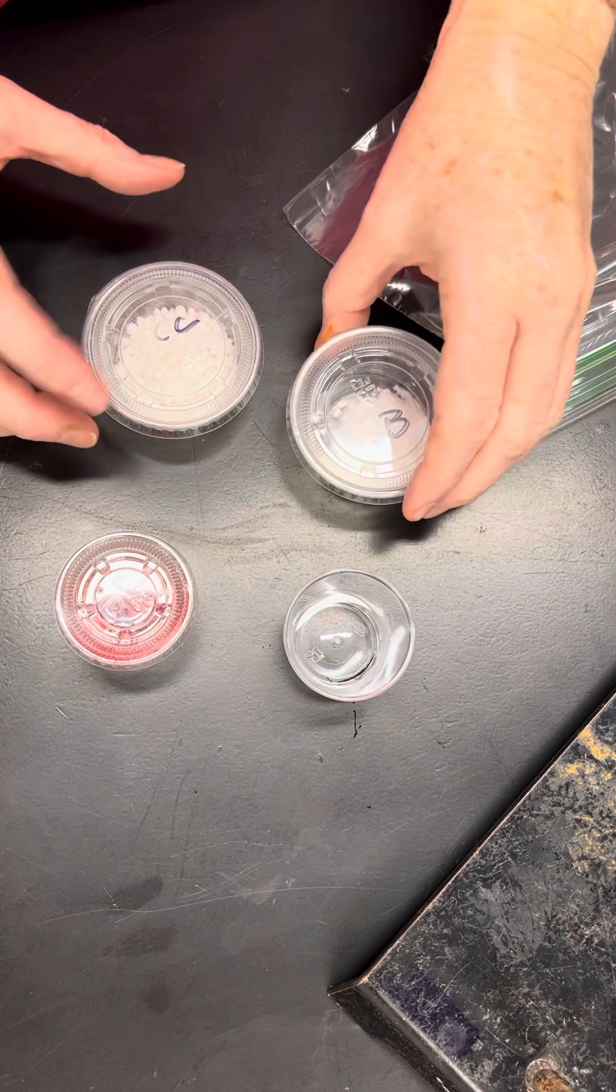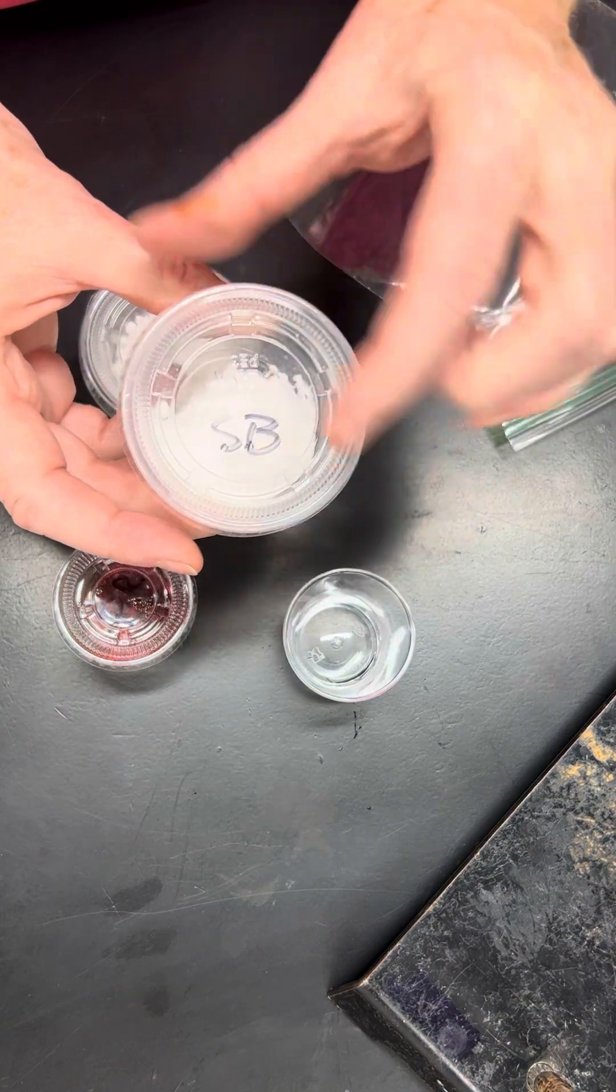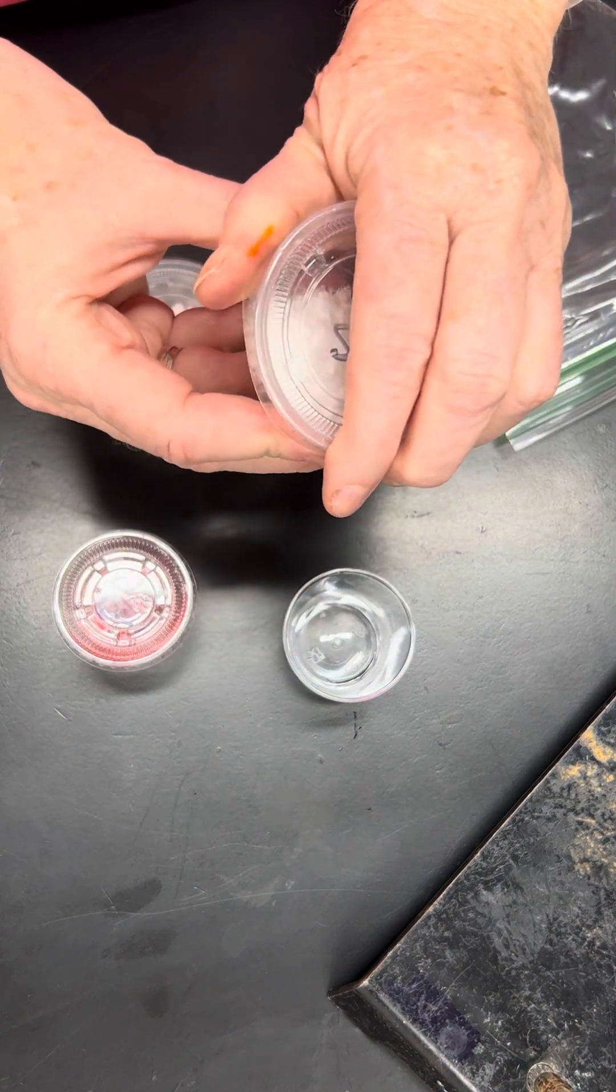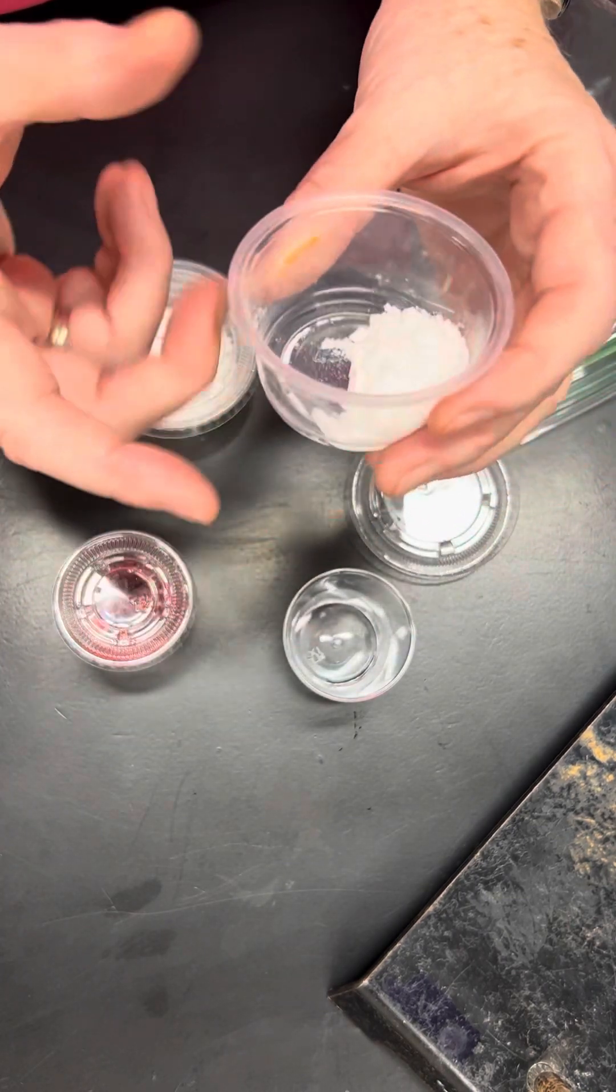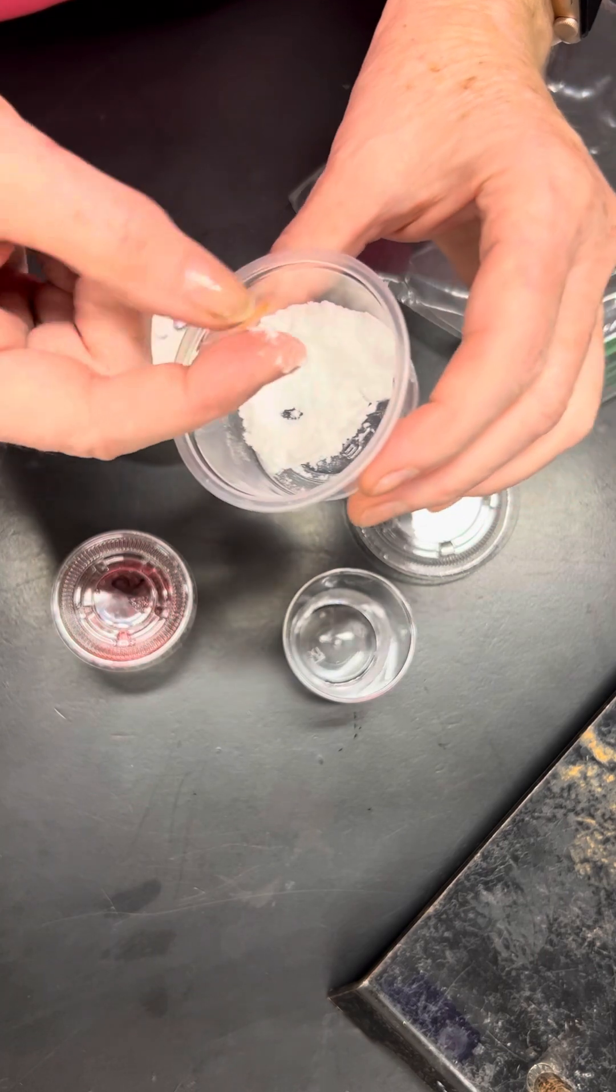The first substance we're using is identified as SB for sodium bicarbonate. Sodium bicarbonate is a white solid. It's powdery.